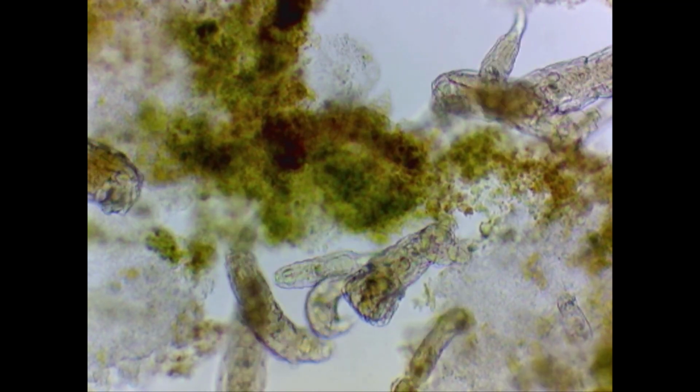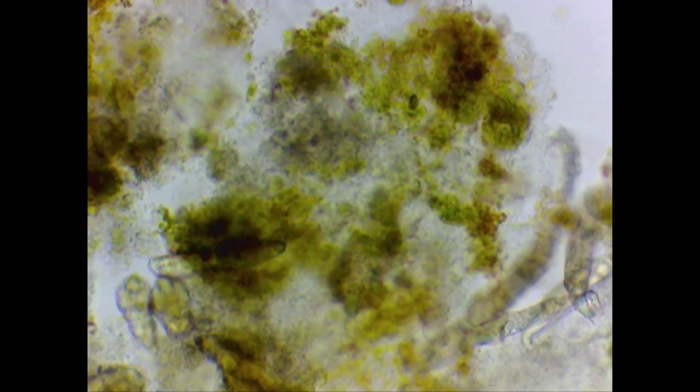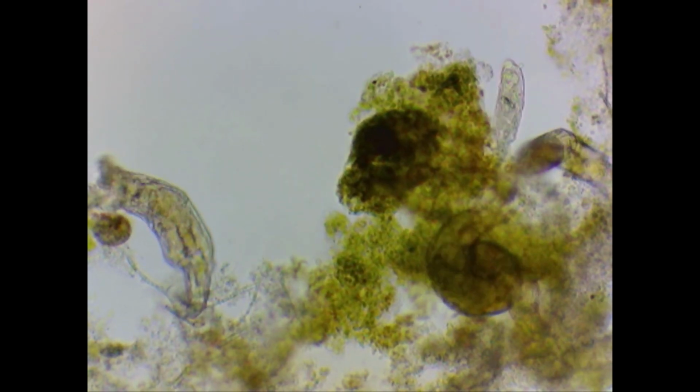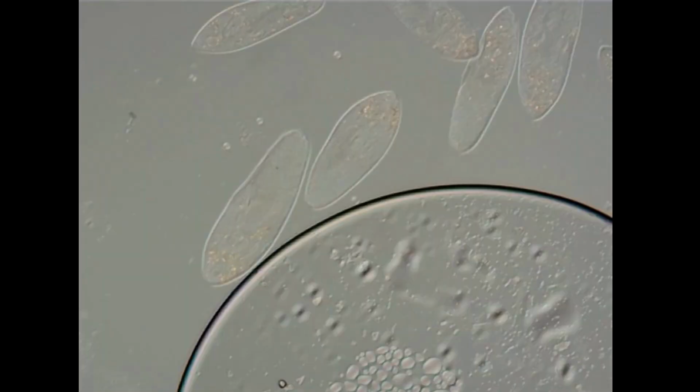You can see here a whole collection of different stages of growth, and they lay eggs or have eggs attached, and that's how they multiply. And pretty neat organisms and fun to watch for sure.